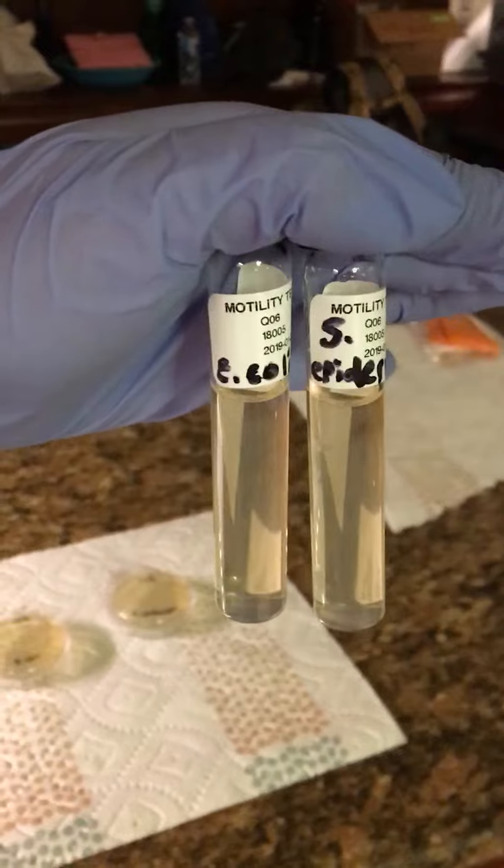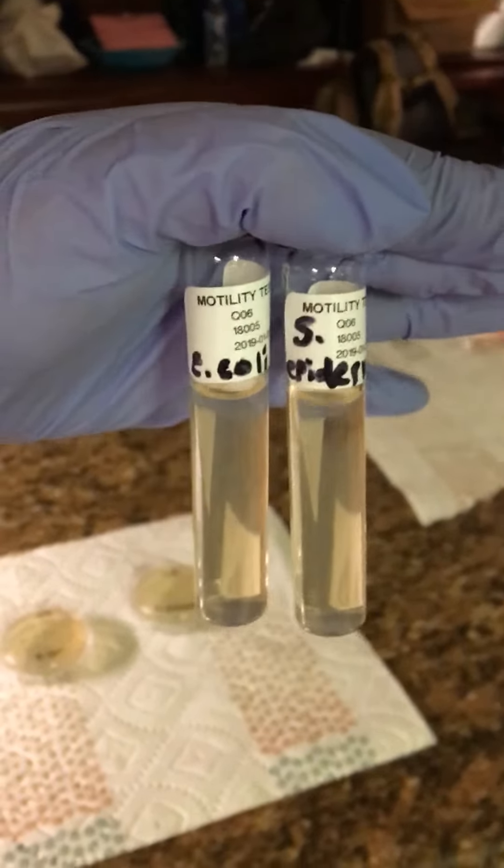Just to prove that I just finished it, here are my prepared motility test tubes and I've already utilized these. The paper clips are in the bleach solution as we speak. The candle is still lit. I will be putting these in my incubation location right now, along with my other lab's incubation.